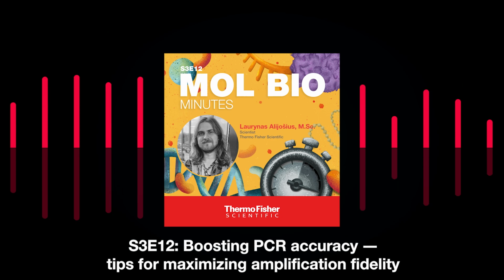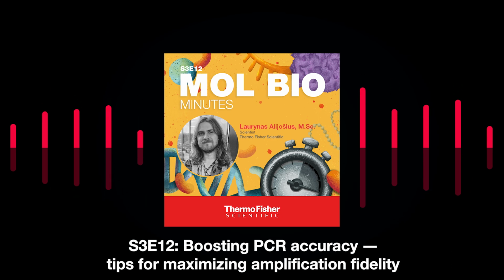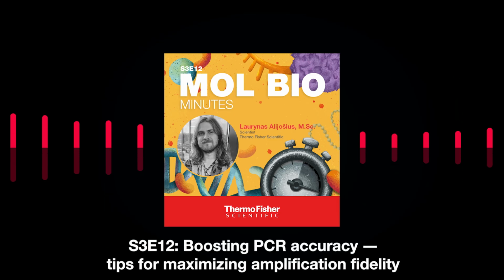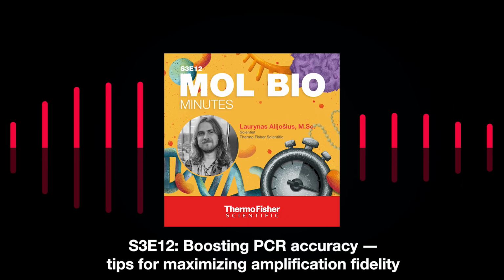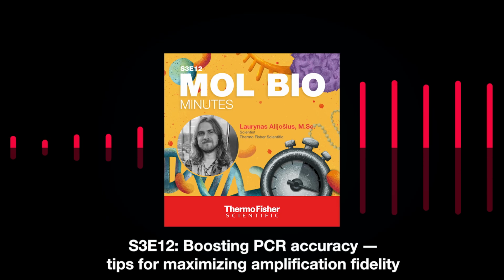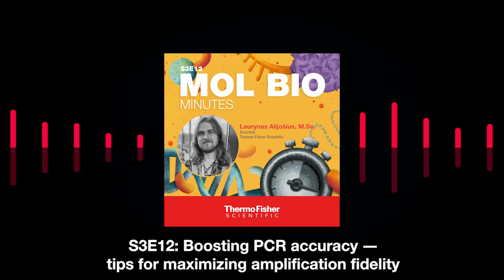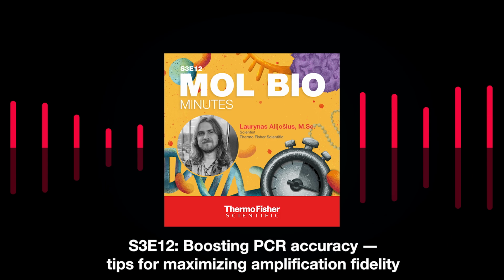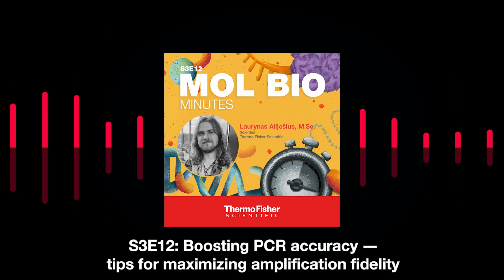I'm not gonna lie here. It was frustrating, but luckily for all of us, we can reduce all these issues by boosting the accuracy of the PCR reaction. So that's what we're going to talk about today: the accuracy of the polymerase chain reaction and everything that comes along with it. First things first, let's talk about what the benefits of having an accurate PCR are.